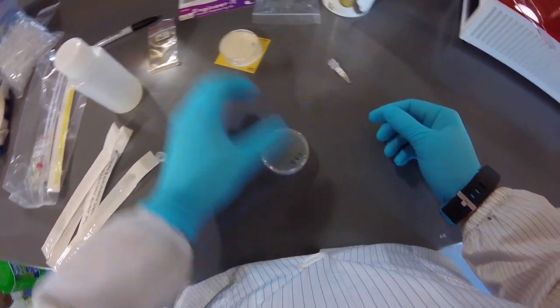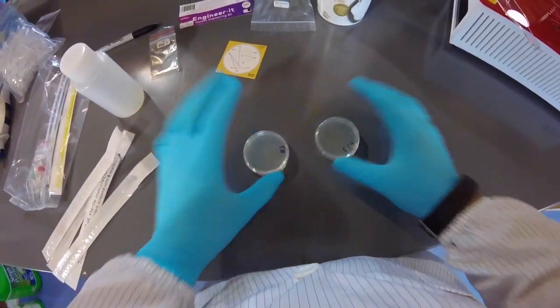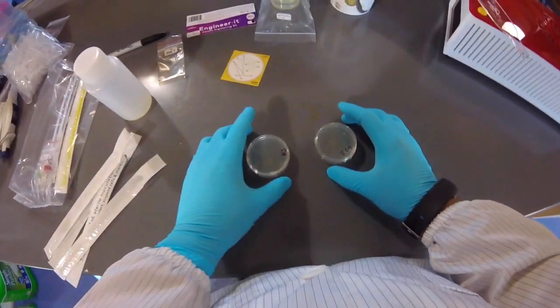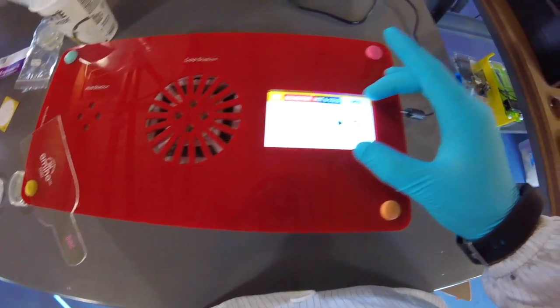All right, so now I have my two dishes that have cells on them. I'm going to take my stab of cells and put that in the waste container as well with the lid open. You put the lid open so that later on when you add bleach, the bleach will be able to get into the tubes. Okay, so now we're at the DNA playground here.